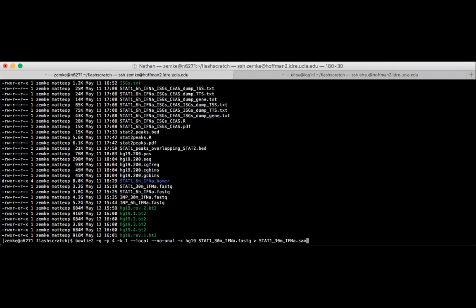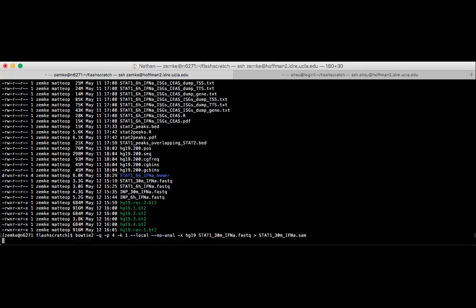Oh, I just realized I sent them to a private chat. One second, hold on, let me send those commands to everybody in the chat. Okay. In case you missed it when I switched the screen. Is that better? Okay. So I'm going to start running the bowtie2 command now.